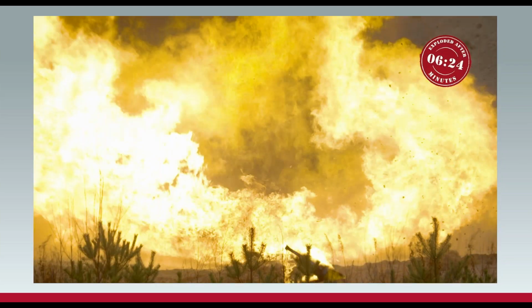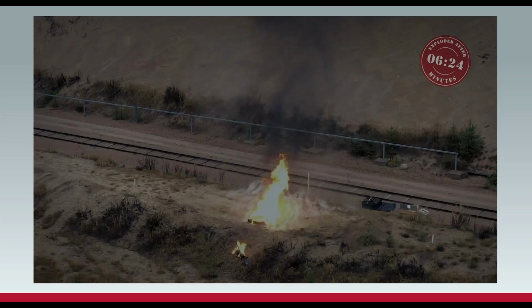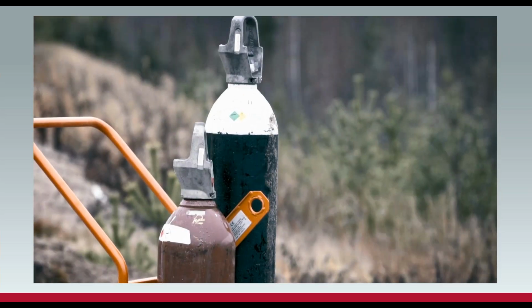All right, so 6 minutes, that hydrogen cylinder blows up, and I mean, that's catastrophic. I don't care what 2-hour windows, doors, rooms, etc. we've got created in the space. It's not going to keep us safe.